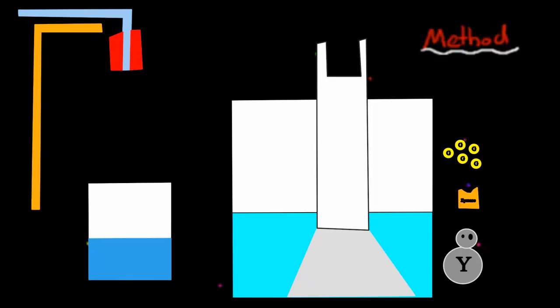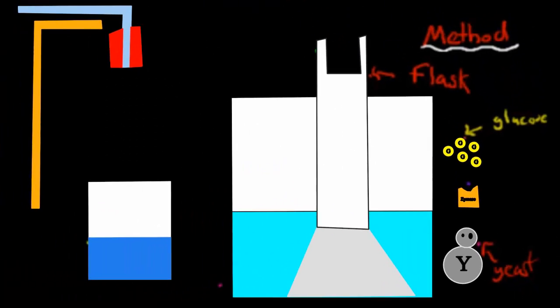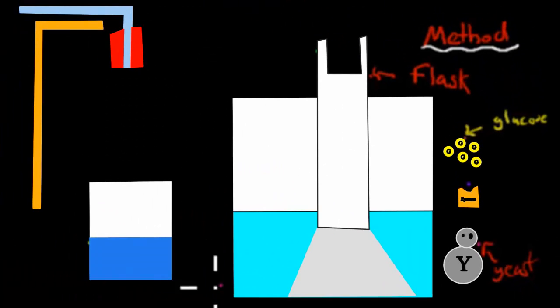Before we start, I want to make sure we label all these things correctly. Right here, we have our flask. We have glucose, these are the glucose solution particles here. We have our yeast on the bottom, that would usually be baker's yeast. We have a warm beaker with water here, about 37 degrees Celsius. And we have our lime water right there.